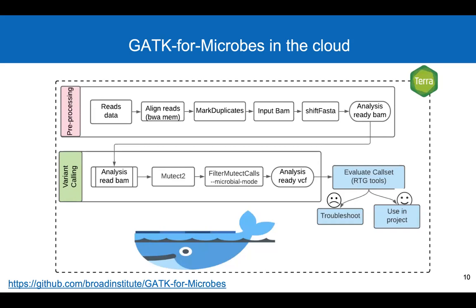And finally, we are using cloud-based methods to enable global collaboration of data and results. We have made the GATK-for-Microbes pipeline available in Terra. Terra is our cloud-native platform developed by the Broad Institute in collaboration with Microsoft and Verily.